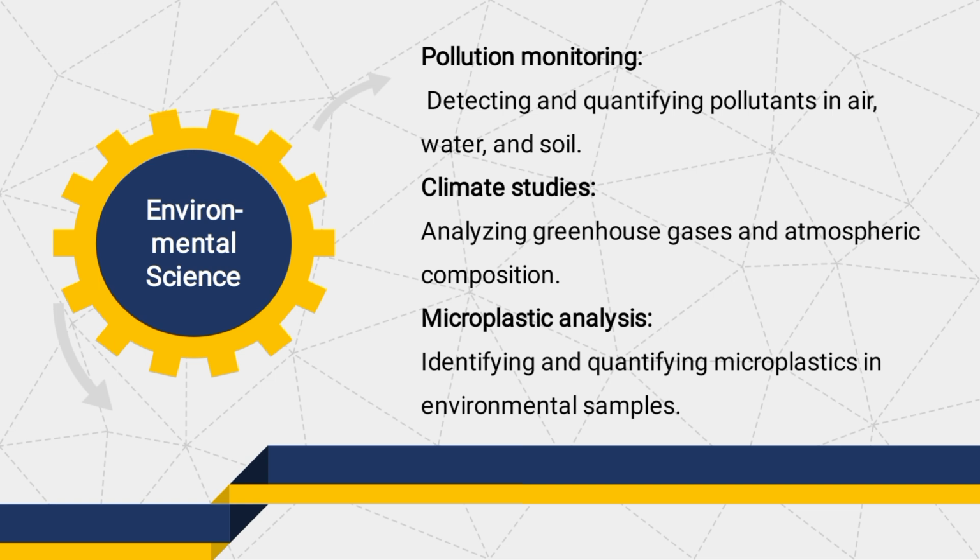In environmental sciences, FTIR helps in pollution monitoring. How? By detecting and quantifying pollutants in air, water, or soil. Climatic studies by analyzing greenhouse gases and atmospheric composition. It can help in microplastic analysis, identifying and quantifying microplastics in environmental samples.